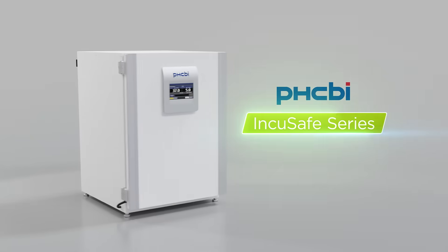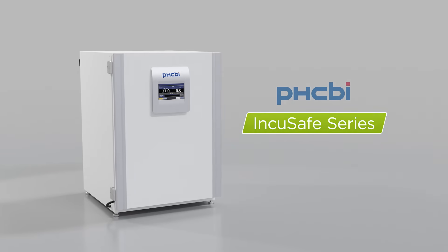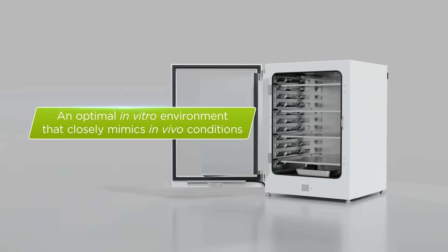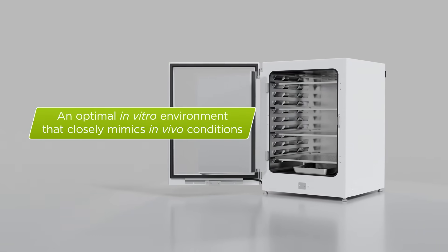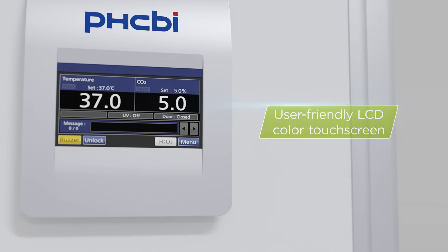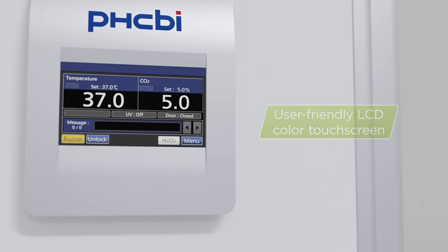Meet the Incusafe Series CO2 Laboratory Incubator from PHCBI Brand Products. Delivering an optimal in vitro environment for cell growth that most closely mimics in vivo conditions, the Incusafe features a user-friendly LCD color touchscreen that can be used while wearing gloves.